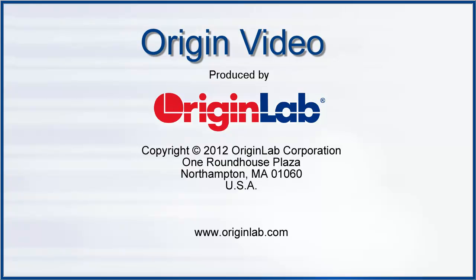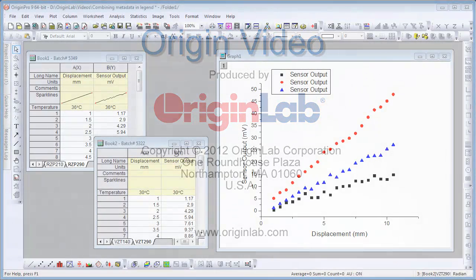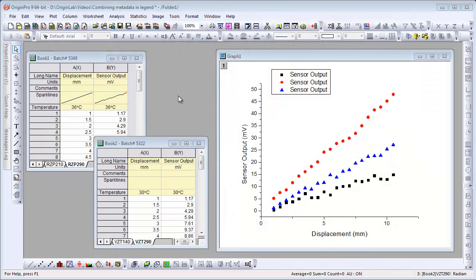In this video I will show you how to customize your origin graph legend. Here we're looking at a project with some sensor data arranged in multiple sheets in multiple books.